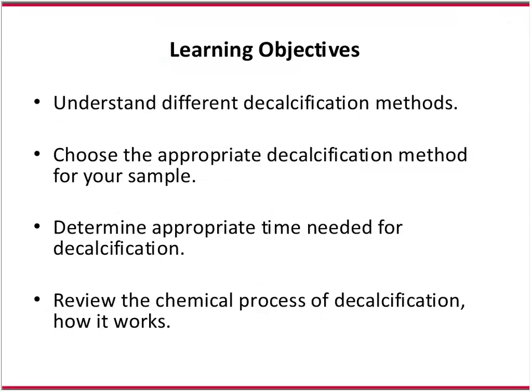So the learning objectives for today are to understand different decalcification methods, to choose the appropriate decalcification method for your sample, determine the appropriate time needed for your decalcification, and review the chemical process of decalcification and how it works.